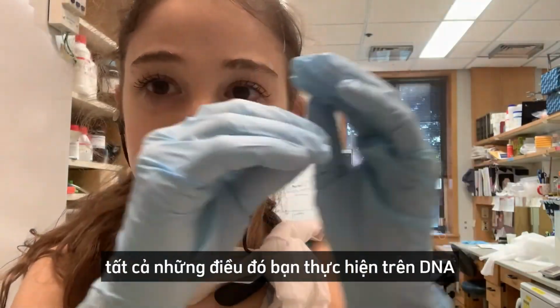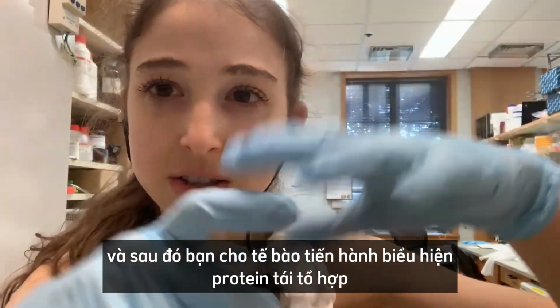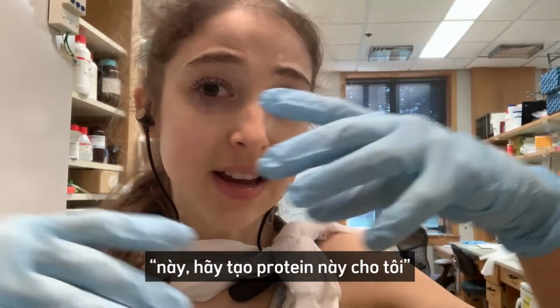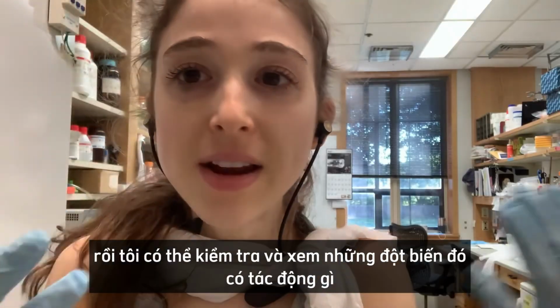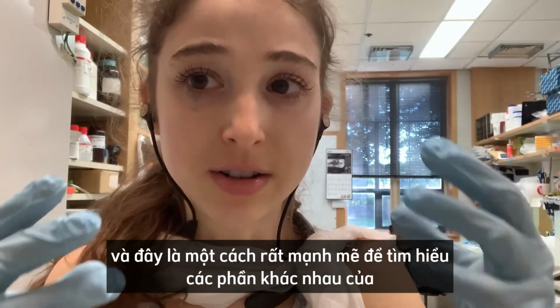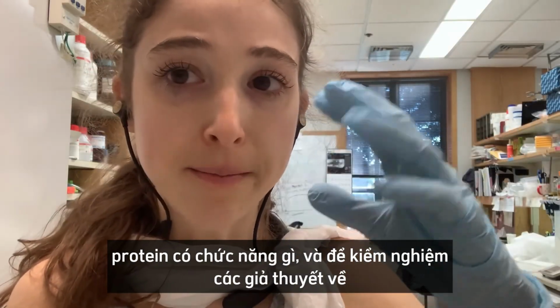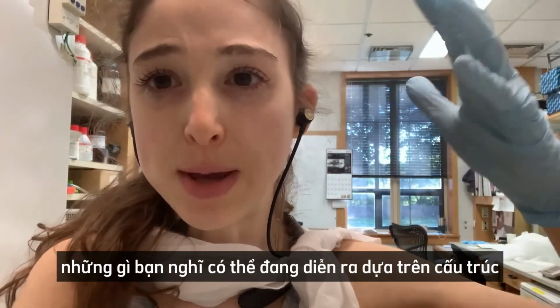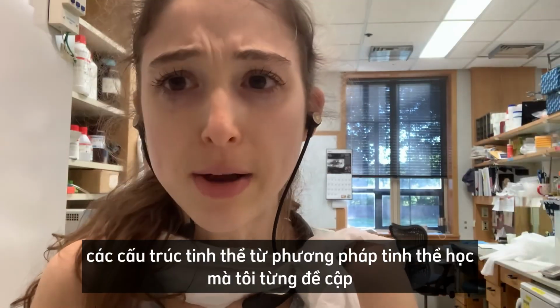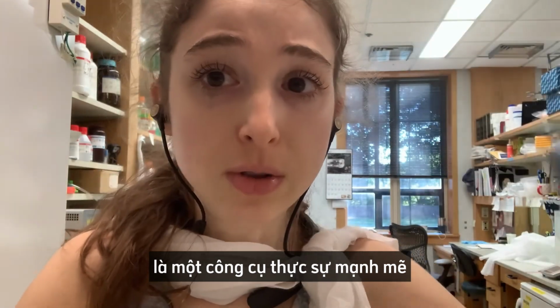You do all that to the DNA recipe for the protein, and then you get the cells to do recombinant protein expression. You stick that plasmid into bacteria and say, okay, make this protein for me, and then I can test and see what effects those mutations had. It's a really powerful way to learn about what parts of a protein do what, and to test ideas about what you think might be going on based on structures, like crystal structures from crystallography that I've talked about. So site-directed mutagenesis is a really powerful tool.